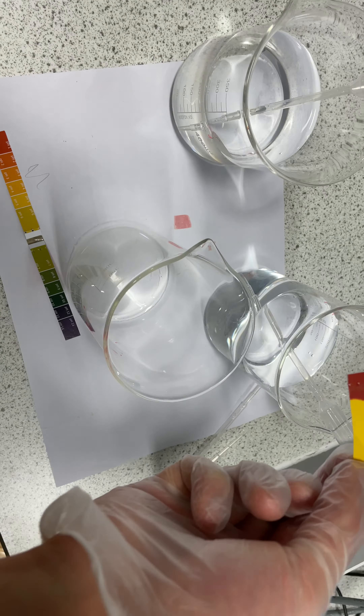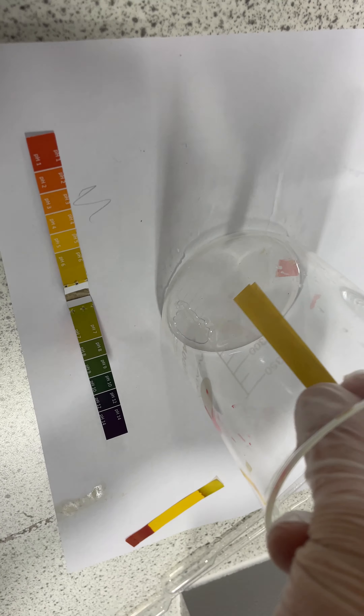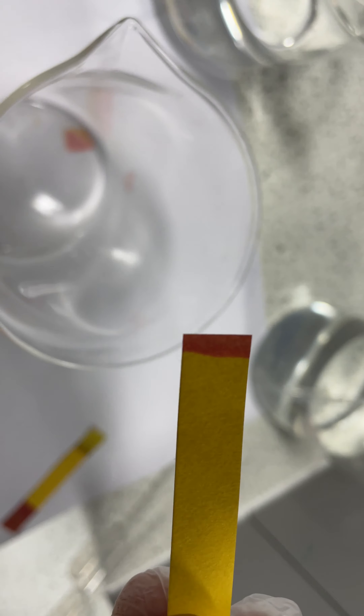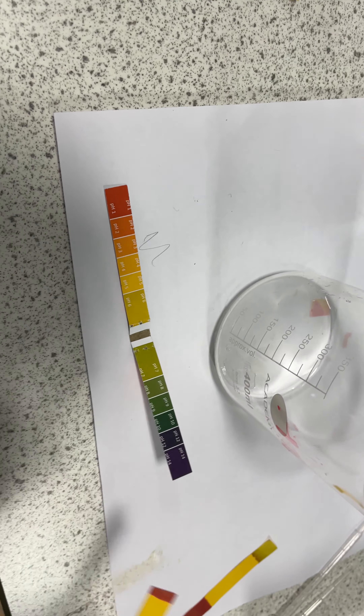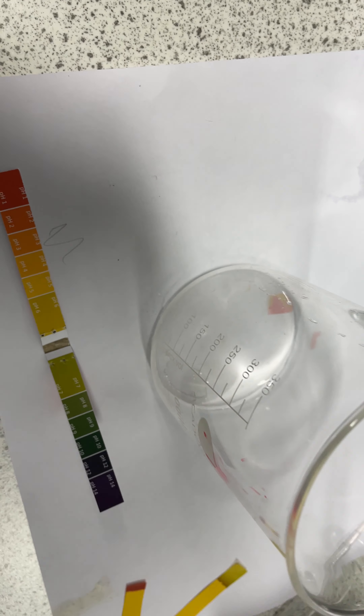I've got pipettes here. If you haven't used a pipette sideways, try not to get air bubbles — press down firmly and take up. We've got a mil there, and I'm going to put a mil of this acid in here.